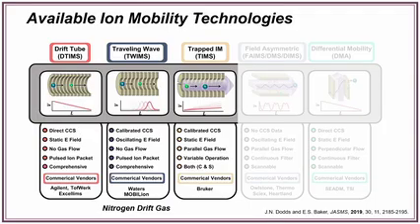These differ from the drift tube instruments in that you have to do a calibration process to obtain collision cross-section values. That means you use a drift tube value from the literature or an online database, measure that same compound, get the drift time, and then calibrate to the drift tube CCS value. In all other senses, it gives you basically the same information as a drift tube instrument. There's just that calibration process to be aware of, and they work very similarly.